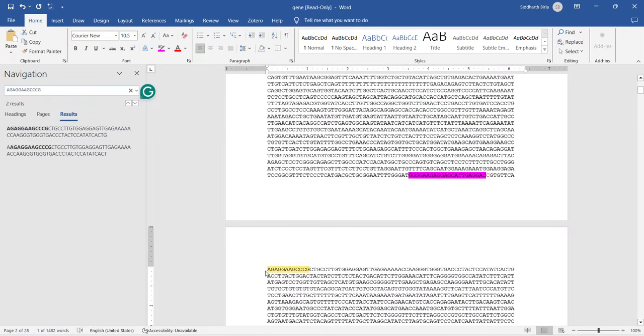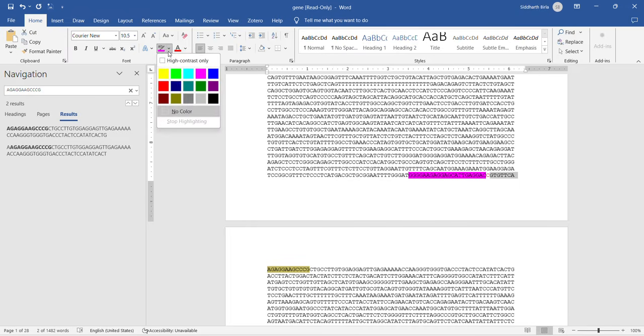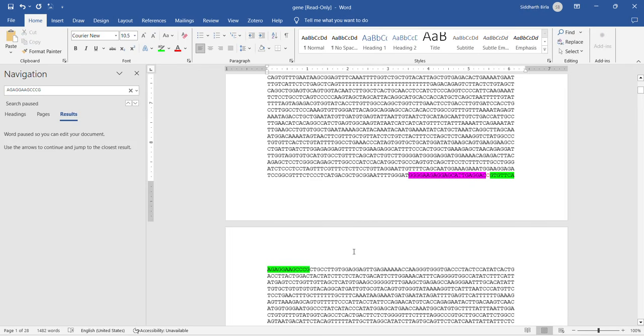Yeah, so as you can see, this is now highlighted, right? So that means what we have selected is correct, and I'll highlight it with maybe some other color. You can press shift and use the arrow keys to select one by one if you are not very good with the, what do you say, mouse or the laptop pad. So I'll just keep it like that.